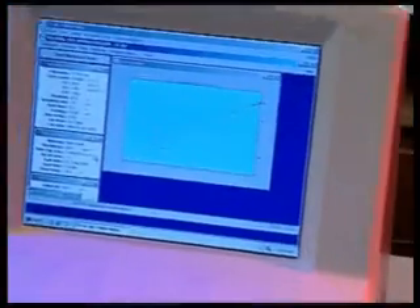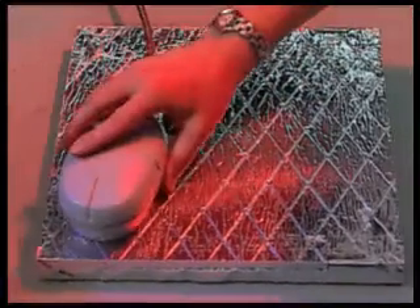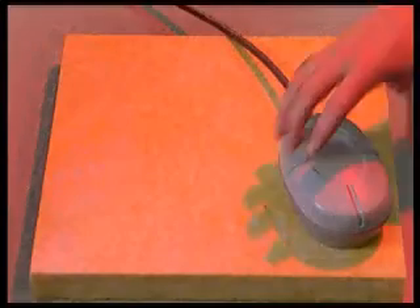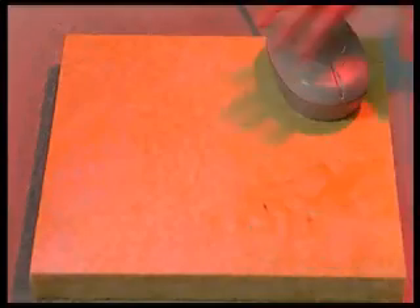The optional external sensors of the TC30 expand its capabilities dramatically. These sensors allow samples of unlimited size and thickness to be tested. This also allows for uniformity to be precisely measured over a large surface.